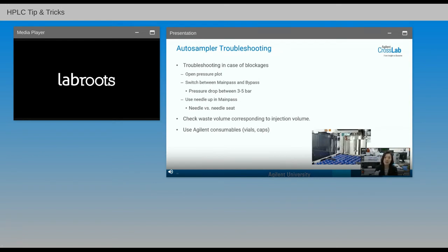Or maybe the metering device at the autosampler that I showed earlier, which controls the amount of the sample being drawn, may be having some leakage as well. So if, let's say, the metering device seals are leaking, it will also affect the amount of sample being drawn to be introduced into the system or even the column. Needle blockage, all these will also affect the peak area.